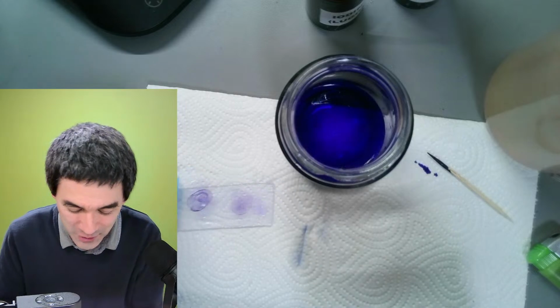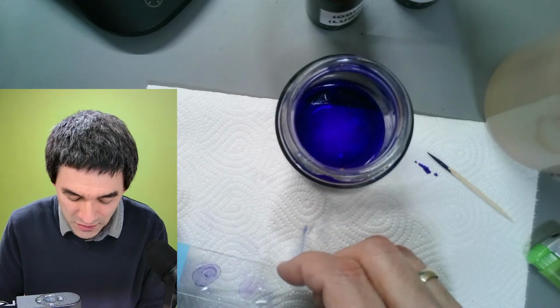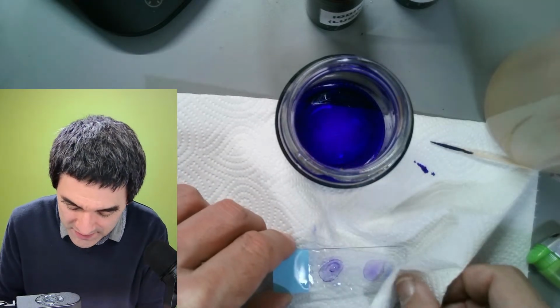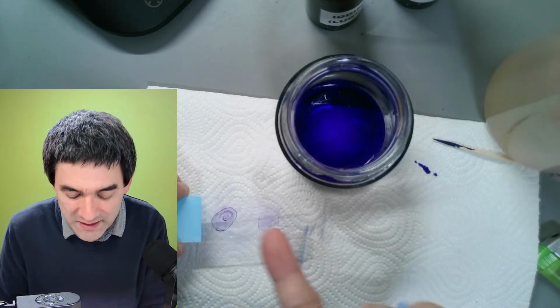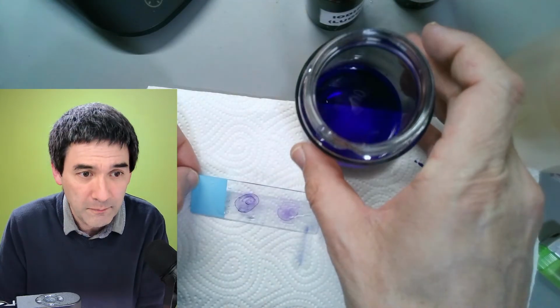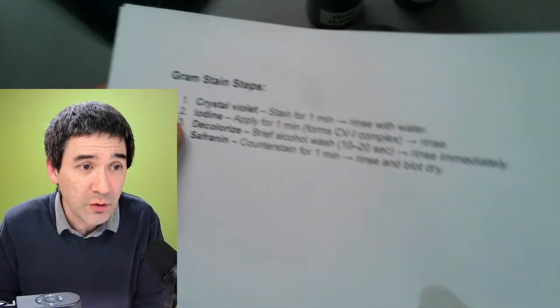There are actually devices that are able to do this measurement. So crystal violet is not only used to make cells visible, but can also be used to quantify and measure how many cells are actually present in the first place. So that's number one. Okay, so step one is complete.